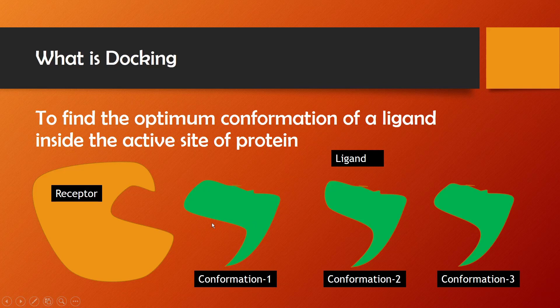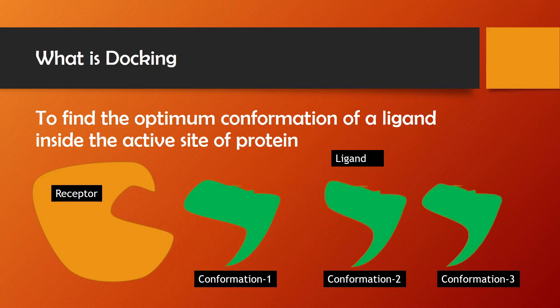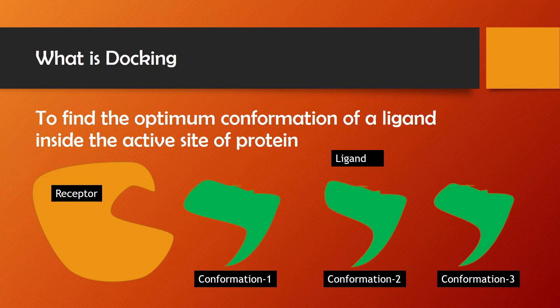It will find which conformation fits well in the active site. For example, conformation one fits very well in the active site. Then we check conformation two — it doesn't fit well. Then we check conformation three — it doesn't fit well either. So MOE software generates conformations of our ligand, places each one by one in the active site, and finds which conformation fits best. This whole process is called docking.